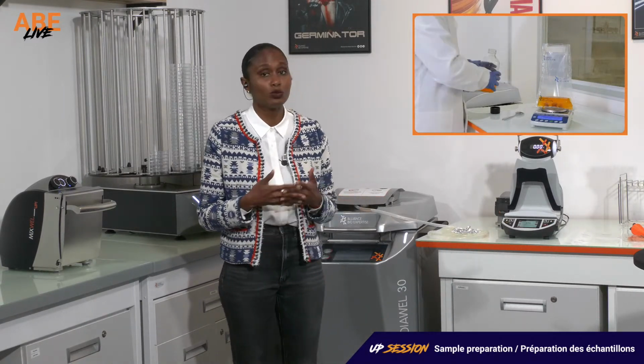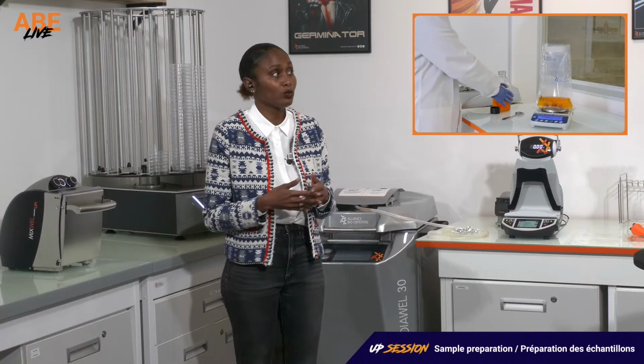It's also not very comfortable because you have to lift your bottles and pour the diluent on your sample, and it can take time. The second option will be to use a gravimetric dilutor, so to go with the automatized solution. In this method, with the gravimetric dilutor, you just need to put your sample on your dilutor, and it will dispense and automatically calculate the right volume to achieve your dilution with the good ratio.